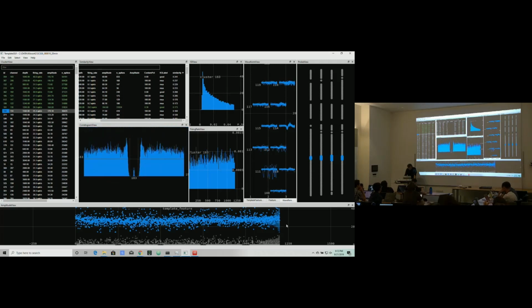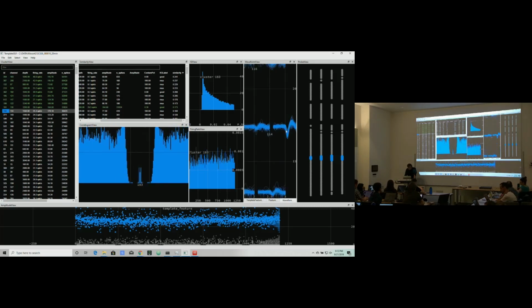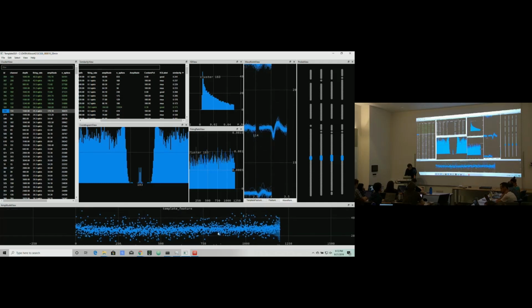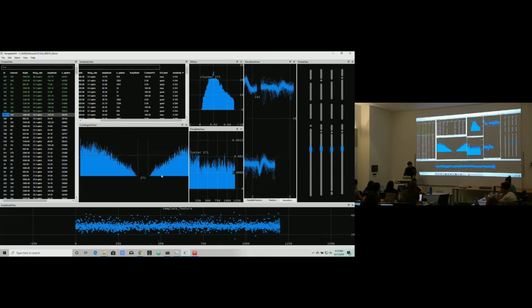That happens in some situations where it's very few actual samples that do that, but it happens when basically a neuron fires such a big spike that the scaling of the template is not sufficient to subtract all of it off. It comes again a second time and subtracts it off again. Those are very rare cases. They'll look a little bit like this. We just learn to deal with it, recognize that it's not a big problem. It'll just be like 5, 10 extra spikes that are doublets.